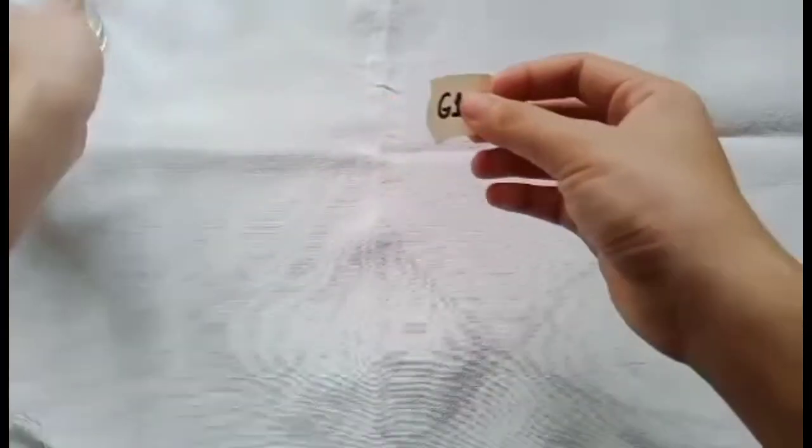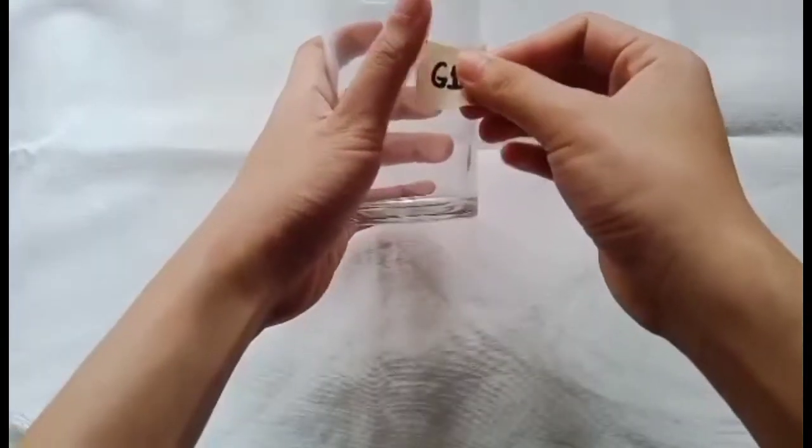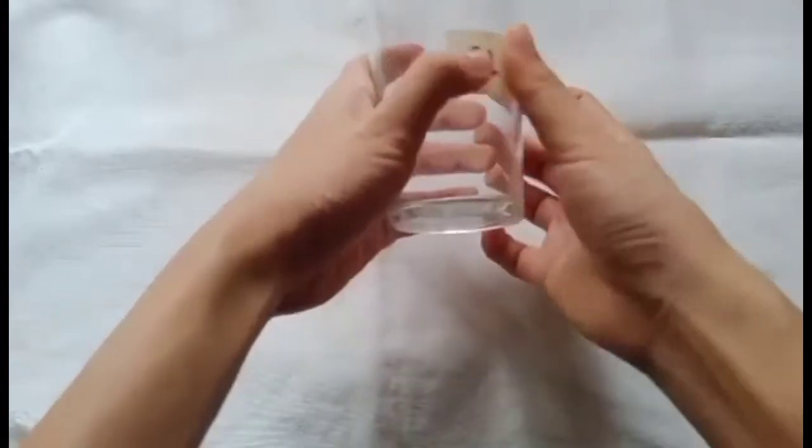Procedure: First, label the clean, dry, clear glass with a labeling or masking tape for you to easily identify the setups.